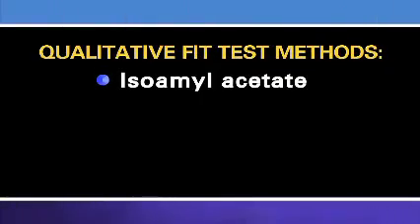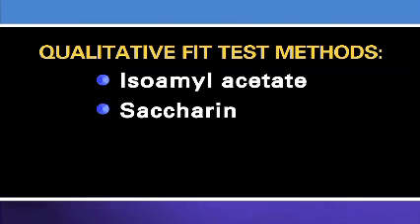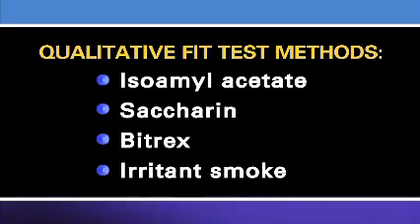Isoamyl acetate, which smells like bananas. Saccharin, which leaves a sweet taste in your mouth. Bitrex, which leaves a bitter taste in your mouth. And irritant smoke, which can cause coughing.